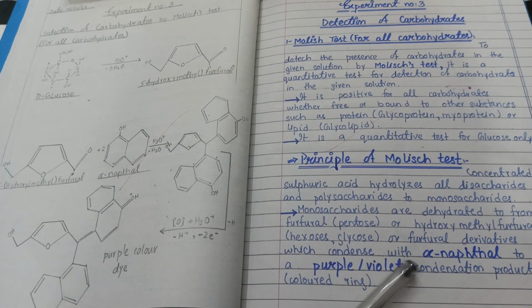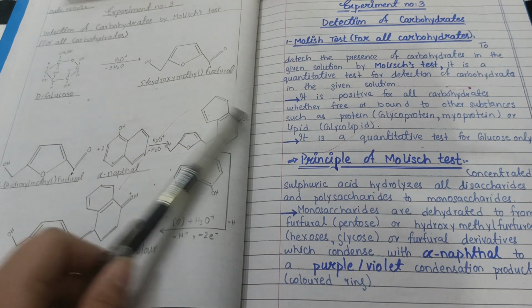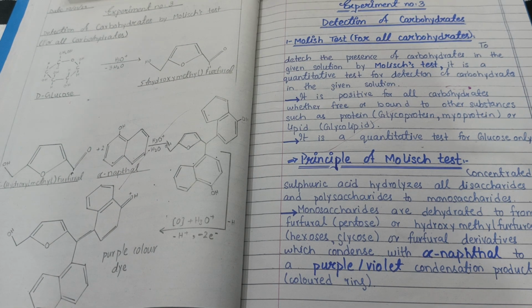By the condensation with alpha-naphthol, you will gain a purple-violet condensation product. So this complex gives a purple color. Due to the appearance of the purple color, we indicate that this solution contains carbohydrate. A solution which has no carbohydrate in it gives no purple color.